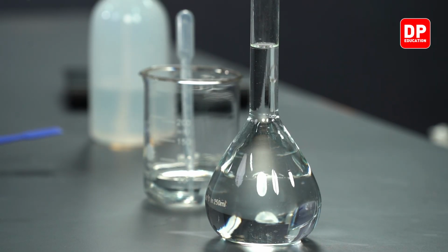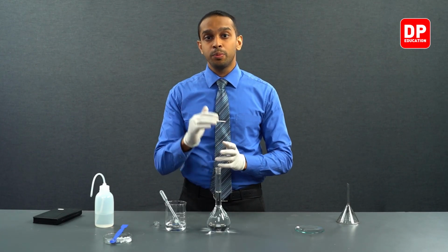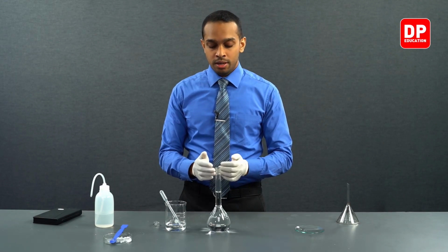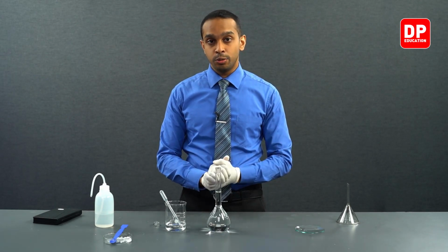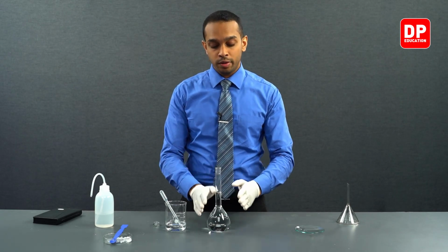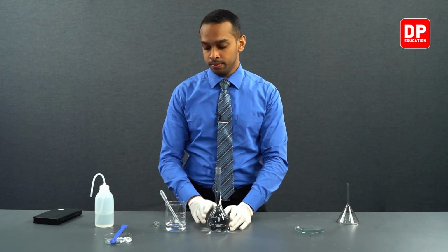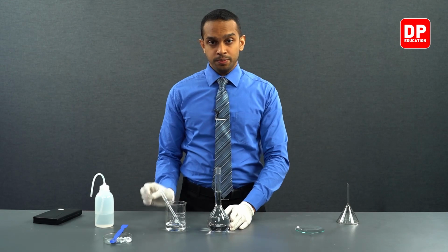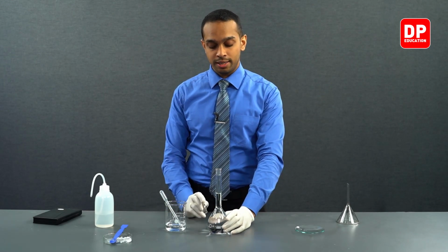If you have added a little bit less water, or a little bit more water, you would not have created a perfect standard solution. Especially if you have added an additional amount of water, you have to discard this entire solution and start over. So after preparing the solution like that, we are not yet done.